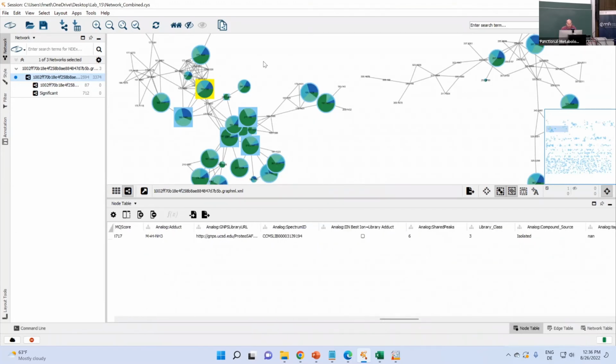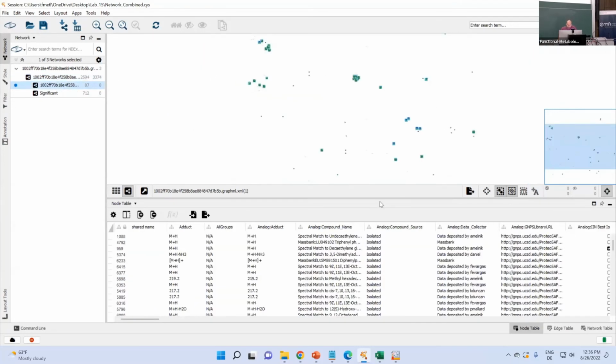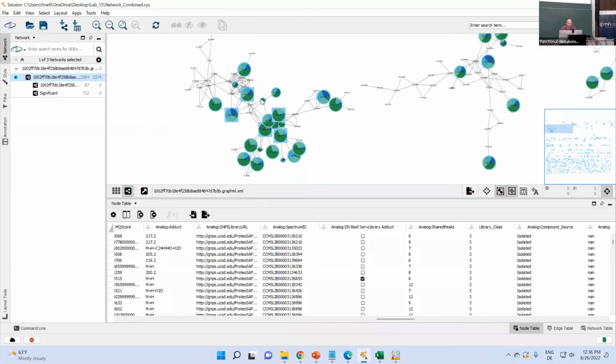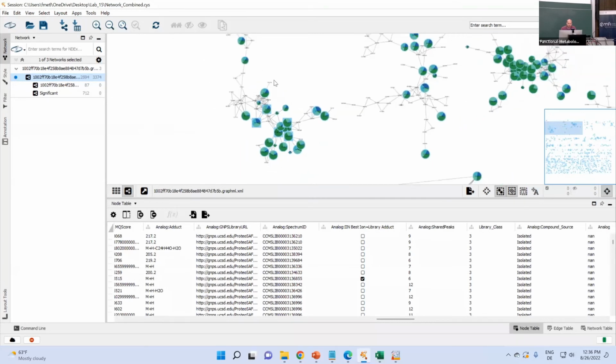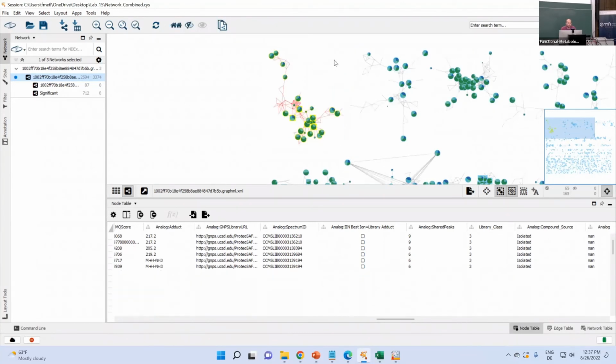Okay. I think before we move to the lunch break, I just want to show you what I do if I found something that I thought was interesting, right? So I created a subset already, but let's assume you're still navigating in your main network, and you now found this network that has a lot of features that were significant and may also have some interesting IDs. So what I would do is mark the full thing by holding Control and then making this box with the mouse around it.